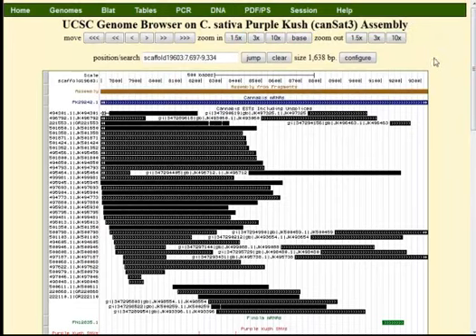There's a lot you can do to explore the Cannabis Genome Browser. I encourage you to take a look, learn how to use the genome browser, and find some interesting things. Thanks very much for your time.